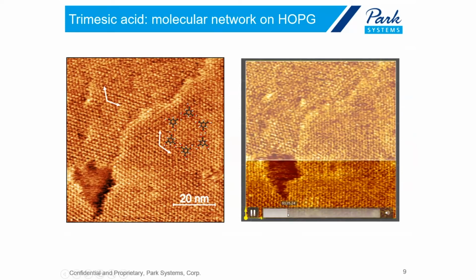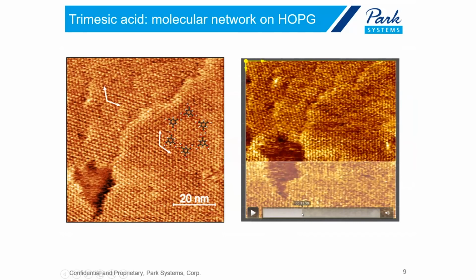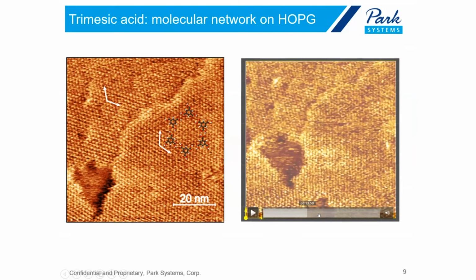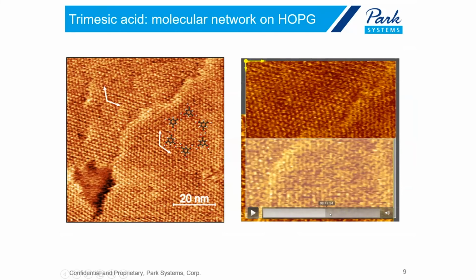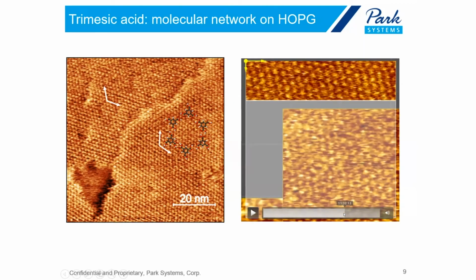At the same time, as we're capturing that dynamics, we also are observing the molecular structure. For instance, now we're seeing another defect forming here at the bottom and so on. Or we can zoom and observe the structure again. But the point is that we observe those structures in real space and real time.